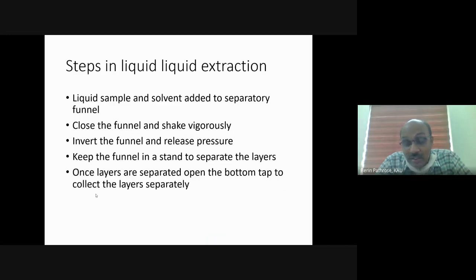So this is liquid extraction. This is still the method used for extraction of pesticides from water, drinking water. This method for extraction of residues takes more than 1 hour for extraction, and it takes a huge amount of solvent also. So this is a cumbersome procedure, and consumes a lot of solvent.